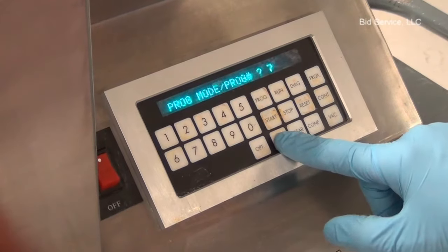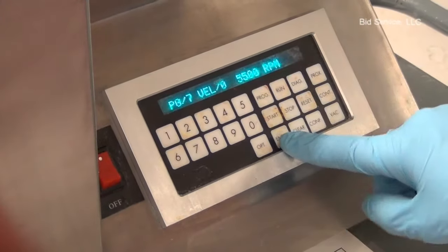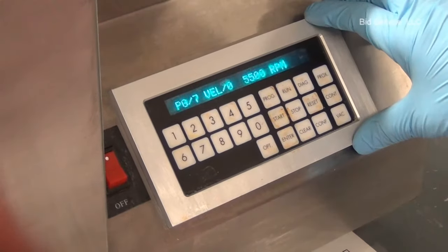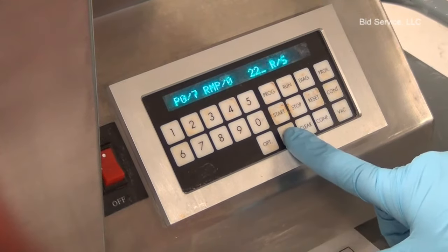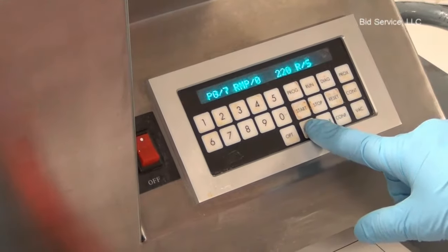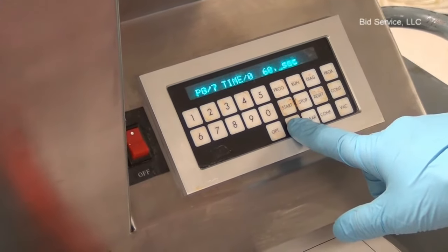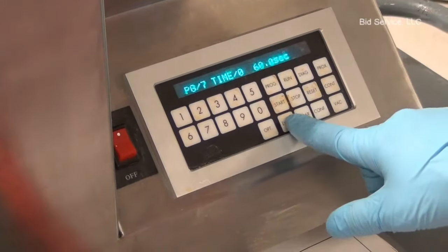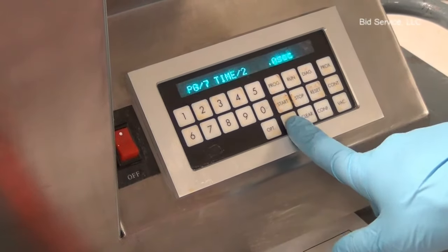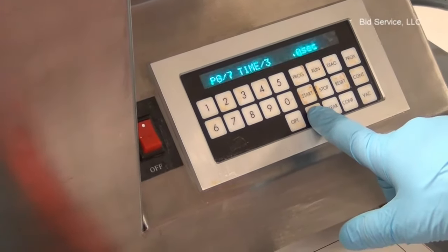I am selecting program number 7, then press enter to advance to the next step in the program. The first step is the velocity — the maximum RPM up to which the chuck should spin. The second entry is the acceleration value; I have selected 220 rotations per second. Then the time, the duration. You can enter different velocities and acceleration values in time, up to three velocities in time.